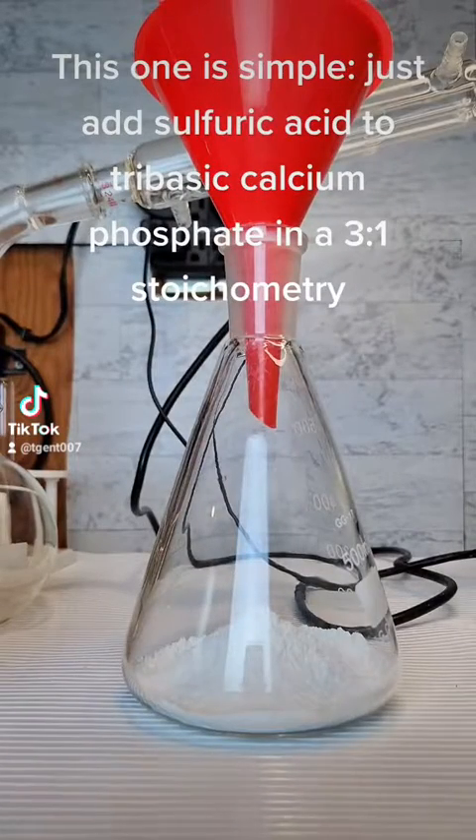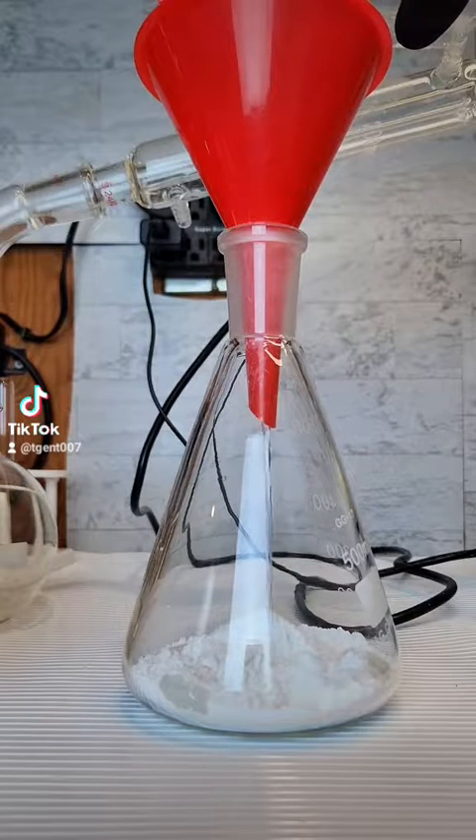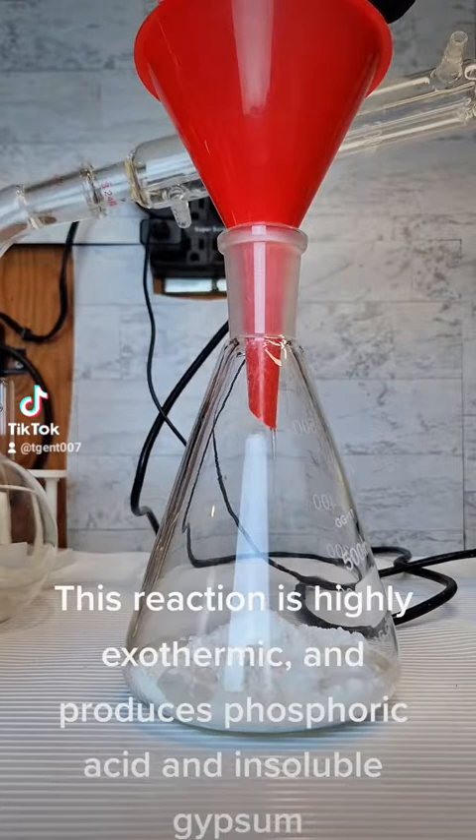Just add sulfuric acid to tribasic calcium phosphate in a 3 to 1 stoichiometry. This reaction is highly exothermic and produces phosphoric acid and insoluble calcium sulfate precipitate.